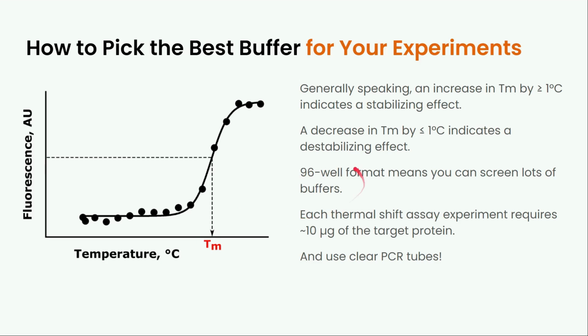And when we say buffers here, we can think about it in the narrow sense, i.e. a specific buffer molecule like Tris or MOPS or HEPES, or you can mean buffers in the broader sense to encompass our entire experimental solution, including additives such as glycerol, reducing agents, different salts, and you can screen literally hundreds of conditions in an afternoon.